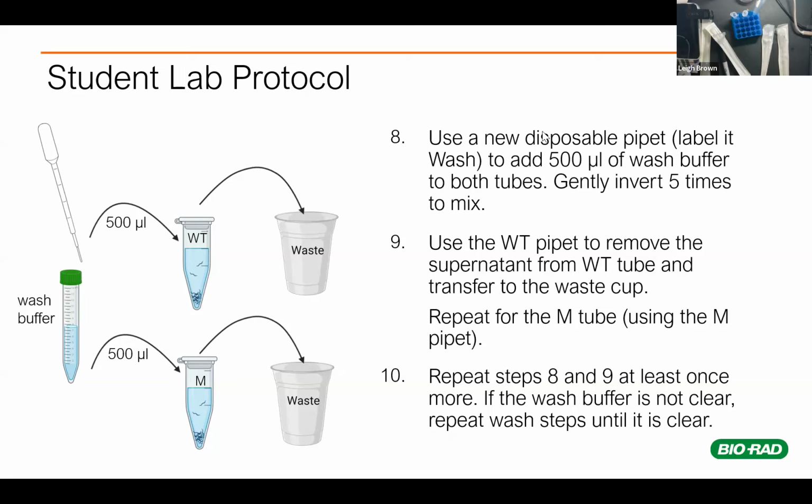So that's what happens when you depress the bulb of the pipette while it's in your worms. They kind of go for a little spa, but they can also just let them sink down to the bottom again if they do that. So it only takes a minute or two.